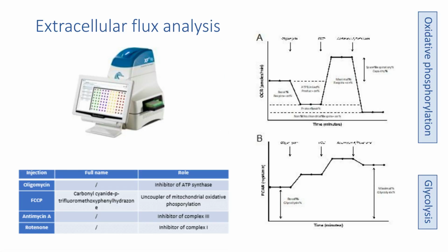Anyone who is familiar with this might call it seahorse analysis, which confuses people. People are always a bit surprised when we use the terminology because they know we're a human immunology lab, and they get very confused when we mention seahorses, and we have to explain it's just the slang name for the piece of equipment.